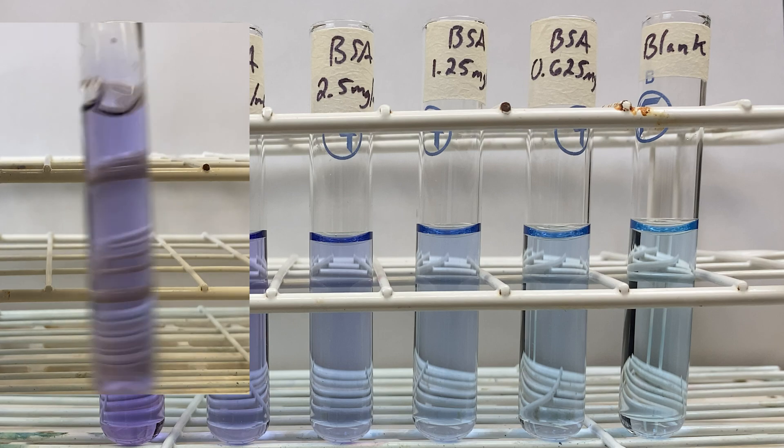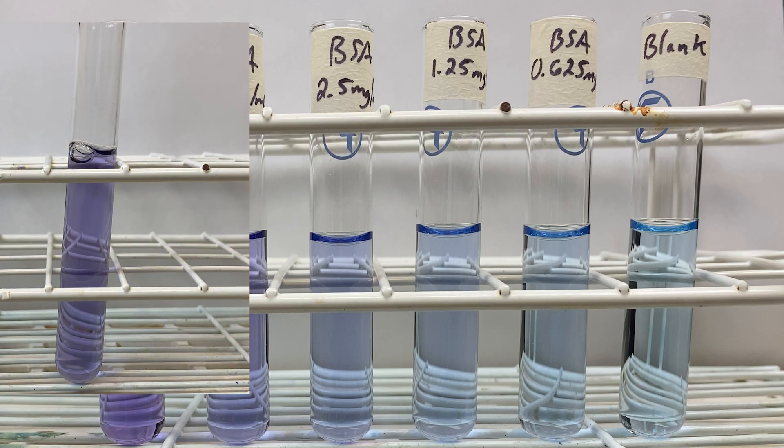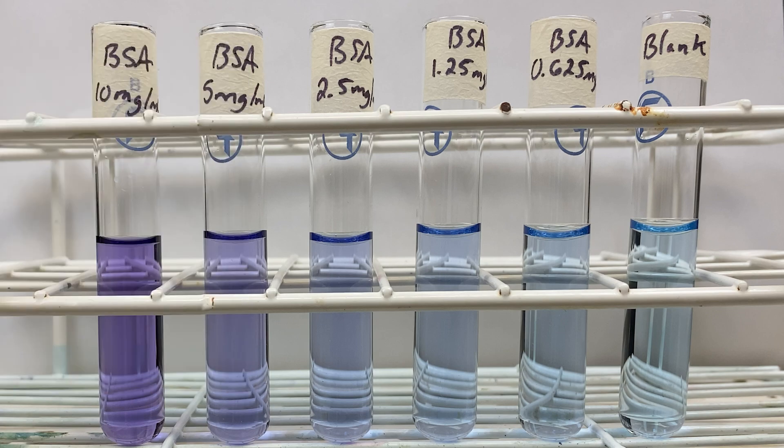The standards we will use today are BSA, bovine serum albumin. It is a protein found in cow serum. We have diluted down samples from 10 milligrams per mL all the way down to 0.625 milligrams per mL as our standards.